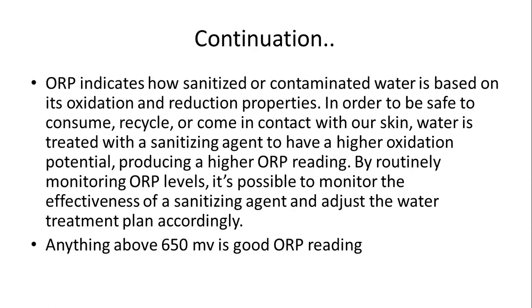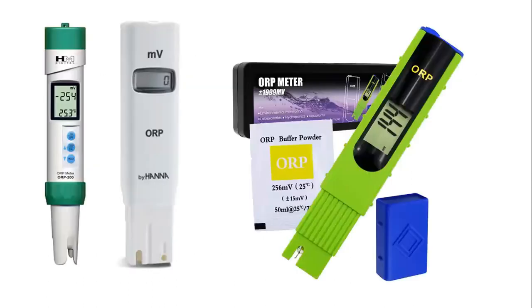What you have there, next slide. You have the ORP meter there. With this test, you can just get your readings directly.